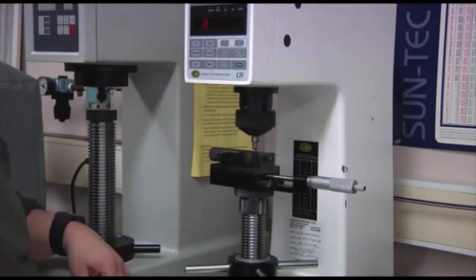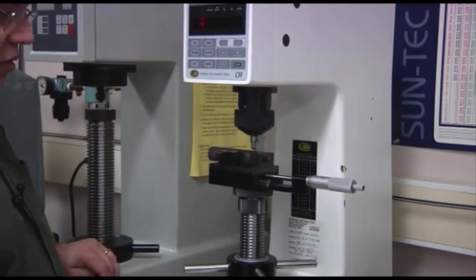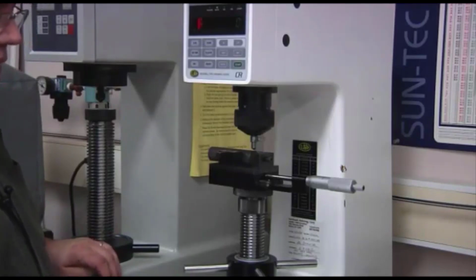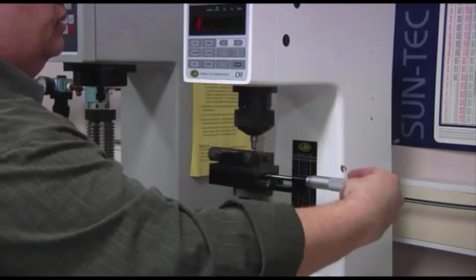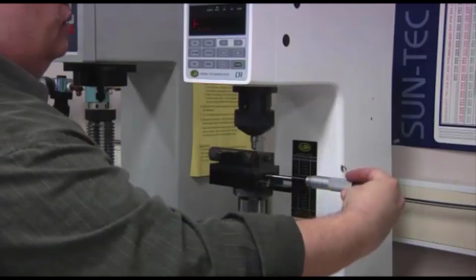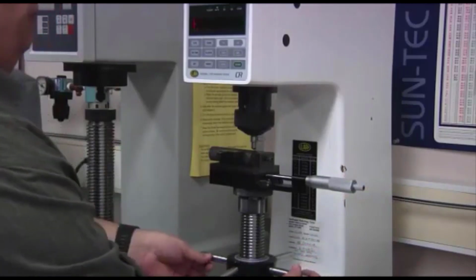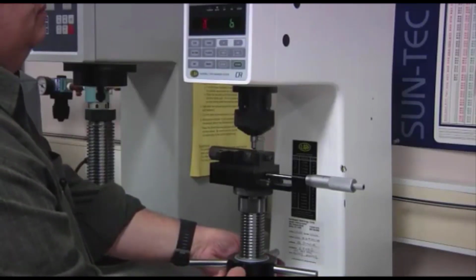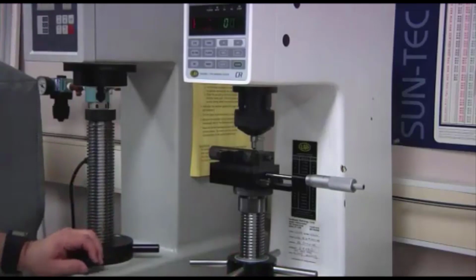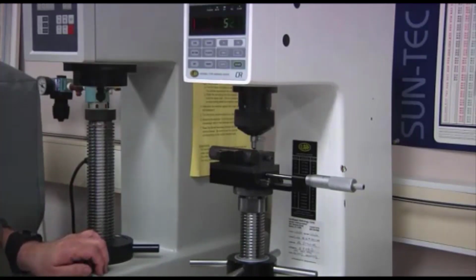Lower the specimen just enough so that the indenter is no longer in contact, and now we can move the specimen to the second location, which is 100.1 thousandths, and so that is another 2 revolutions. 1, 2, and we repeat the measurement. 52.4.